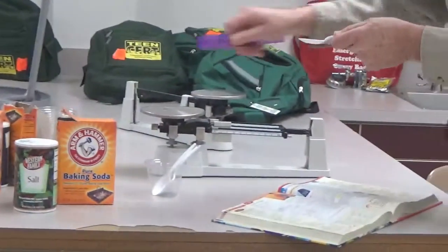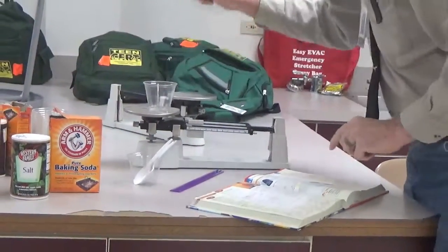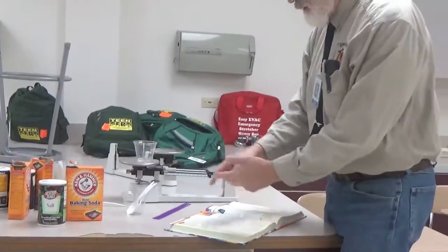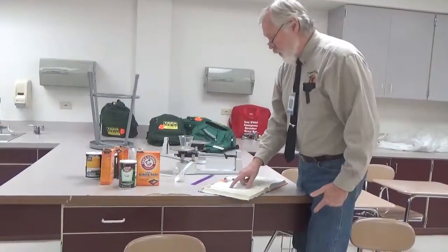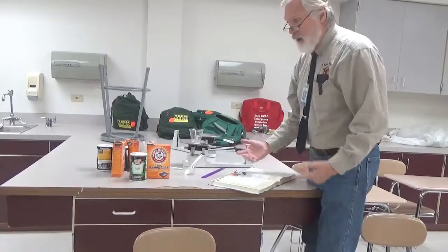A level teaspoon, drop it into a cup. You should have already massed the cup so you knew how much it was, see how much went up. You record that in your data. You needed the mass of water, sodium chloride, and sodium bicarbonate.